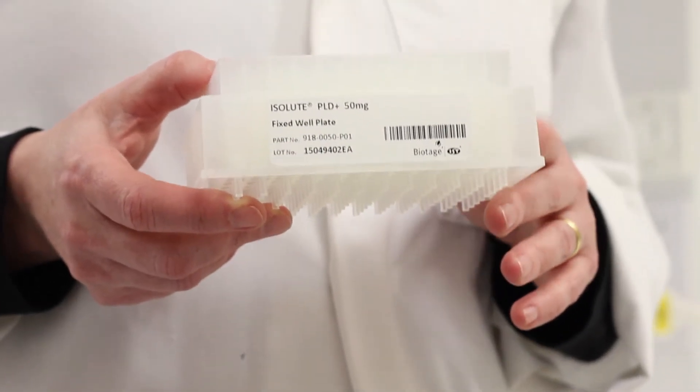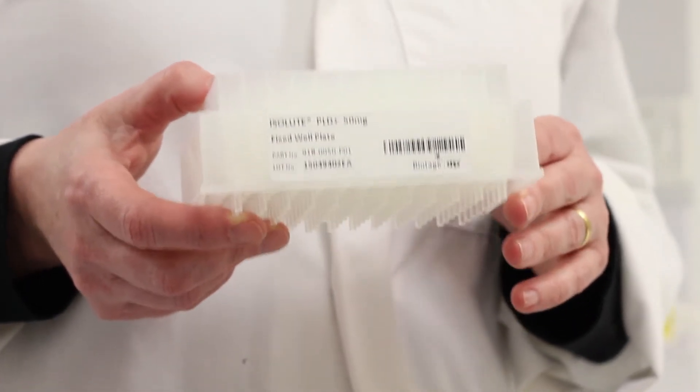The Isolute PLD Plus protein and phospholipid removal plates do exactly what they say. They clean up proteins and phospholipids in blood-based samples like plasma and serum, leaving them perfect for LC-MS analysis.